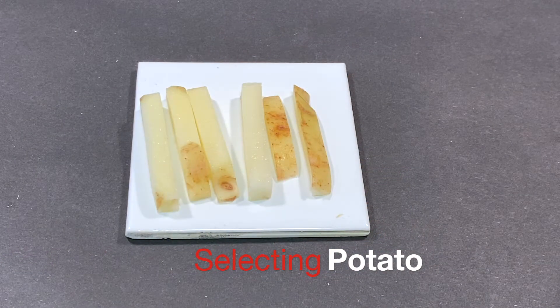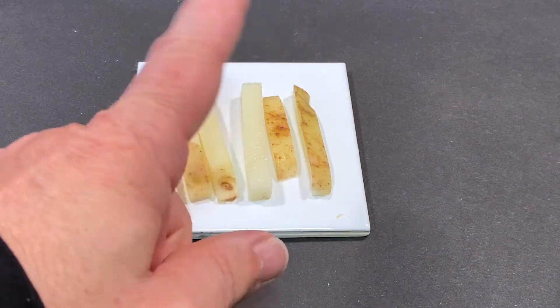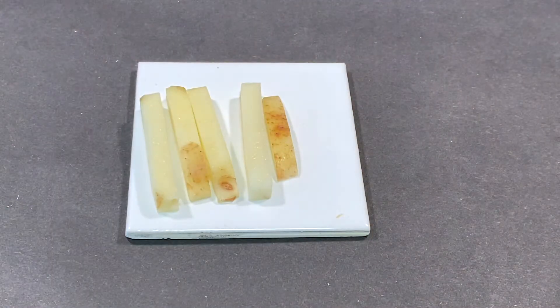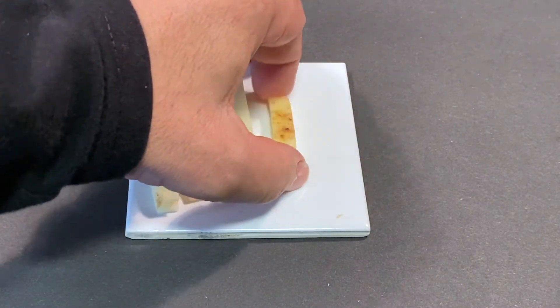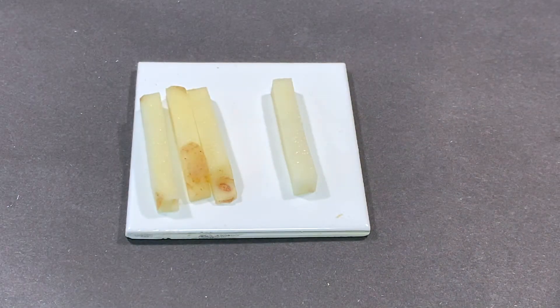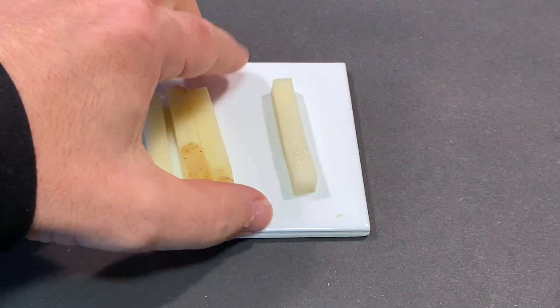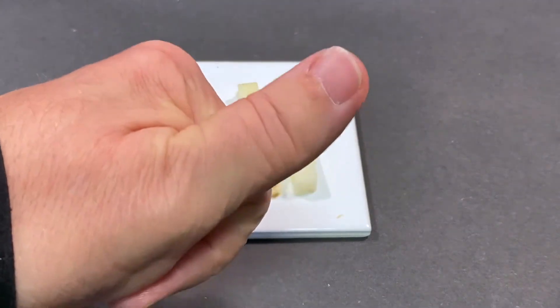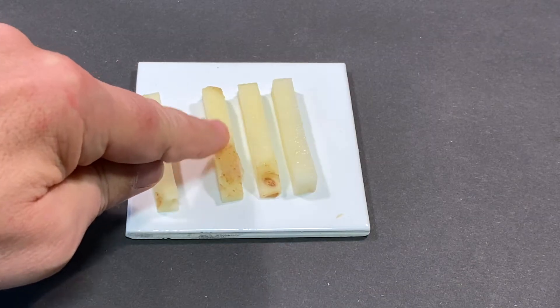The potato tuber you are provided with has a cross sectional area of 10mm by 10mm. Choose only the potato tuber samples which do not have any potato skin on the outside. Nominal amounts of skin on the ends of the sample can be trimmed away. As far as possible this will mean that each potato tuber sample will be able to be affected by the concentration of the sucrose solution evenly.